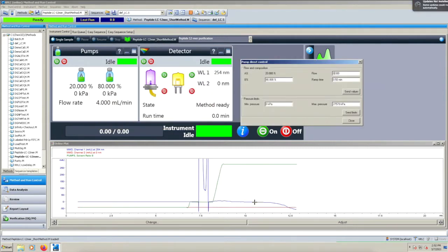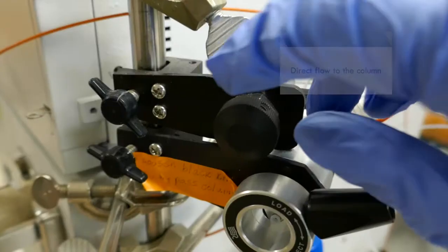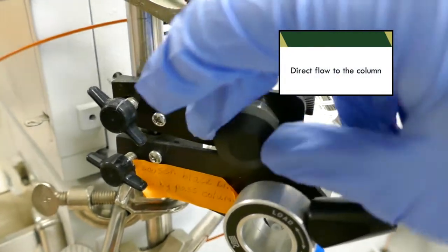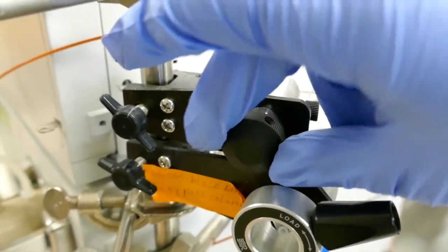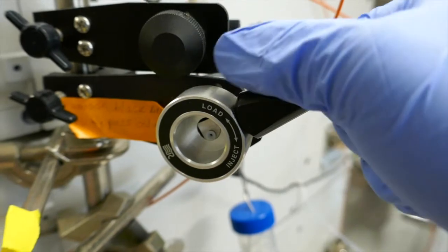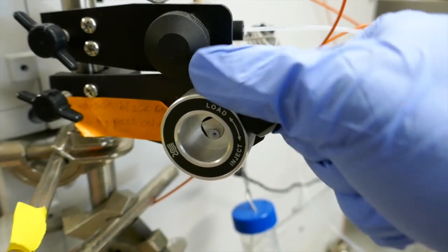Let the pump run for 1 to 2 minutes at 4 mls per minute before you bring it back down to 0 mls per minute. In order to direct flow over the column, tighten the black knob bypass back and then switch the injection loop to the load position.